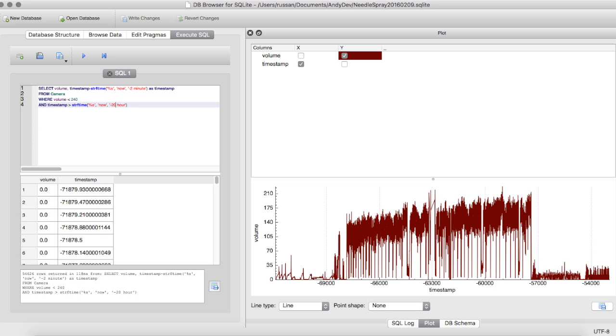Third, the high voltage spray time has been steady over a time frame of several hours, but we've noticed significant changes in spray time from, say, 50 seconds down to less than 5 seconds during different points in the project development. We're not sure why. We've fiddled a bit with the specific voltage and the gap, but currently we don't know what the cause of that variation is.